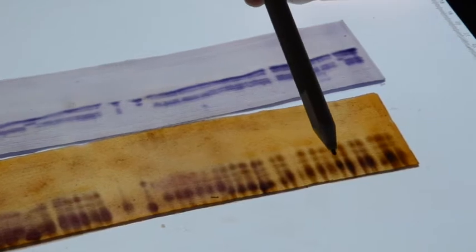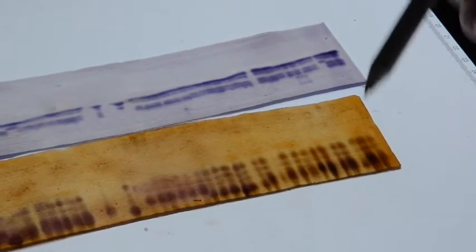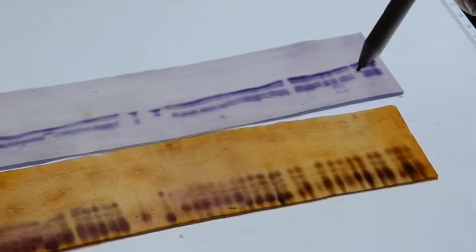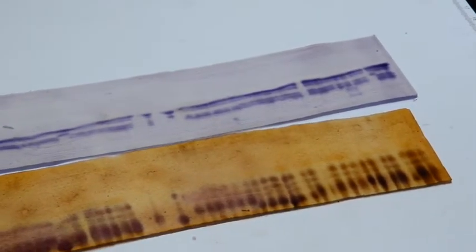When exposed to electrophoresis, these different forms of the enzyme known as isozymes will migrate at different rates and produce distinctive banding patterns. Based on the female and male inbred patterns, an expected hybrid pattern can be determined for each isozyme.